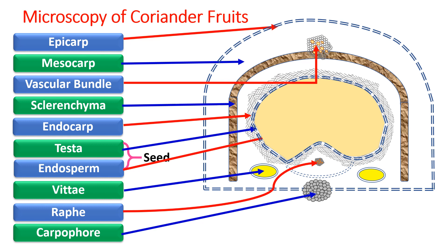Raphae are also present. These raphae form a single smaller bunch of vascular bundle passing through the center. Lastly, the carpophore is a group or bundle of cells that joins two mericarps to form a cremocarpus fruit.